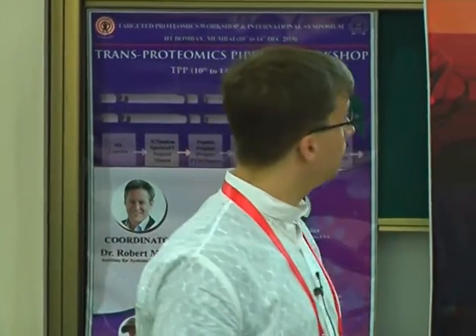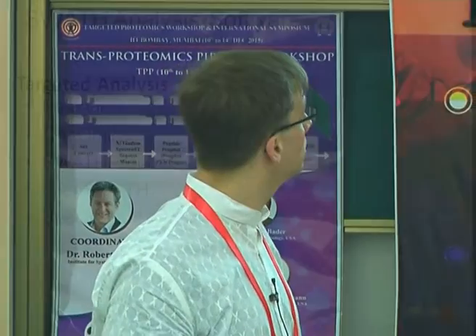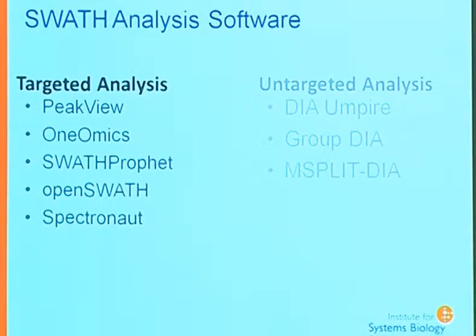And if remote desktop doesn't want to, it doesn't matter. I'm going to do that with the PeakView software. This is a commercial software of SciEx. I'm not entirely sure if that comes just with every TripleTOF and so on, but I'll do this. So I'm going to show you the analysis the targeted way, not the untargeted type of analysis. I'm going to use PeakView because it has a nice graphical user interface.